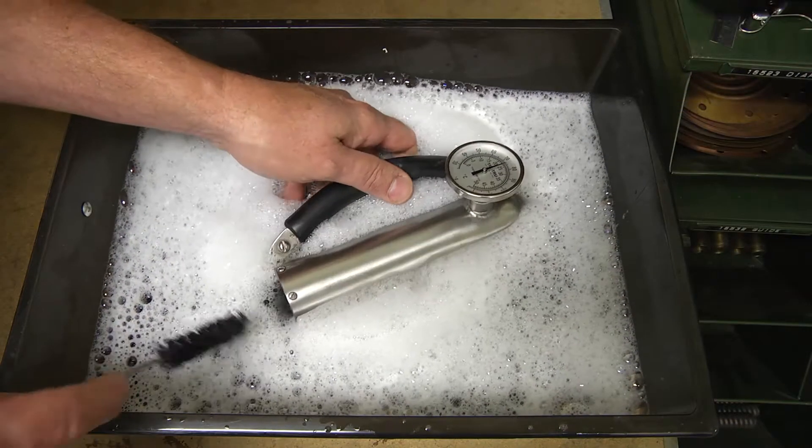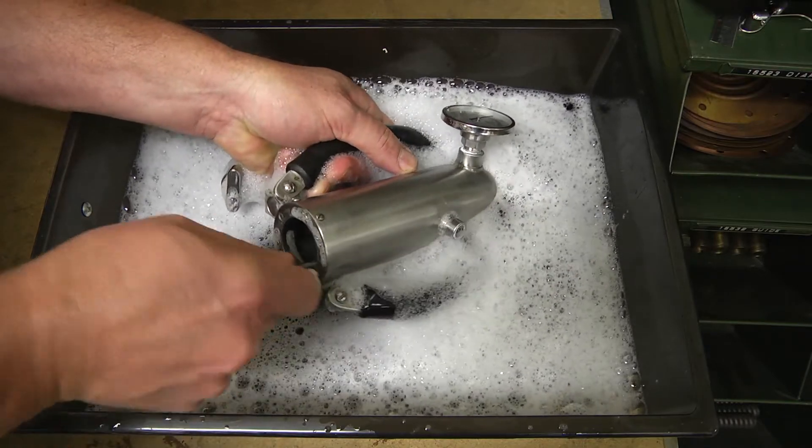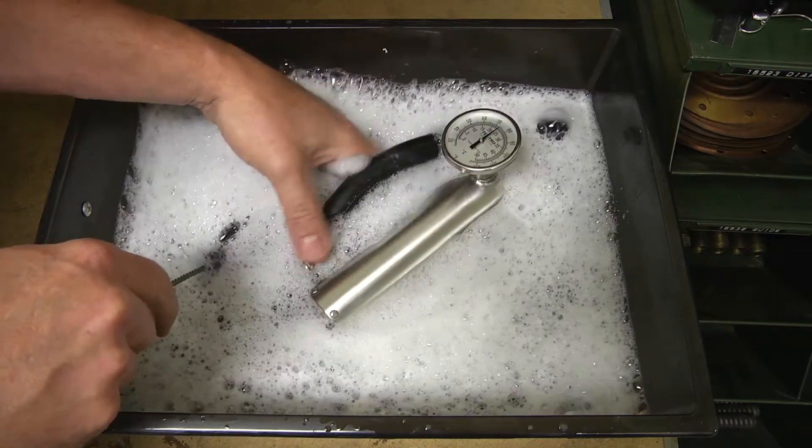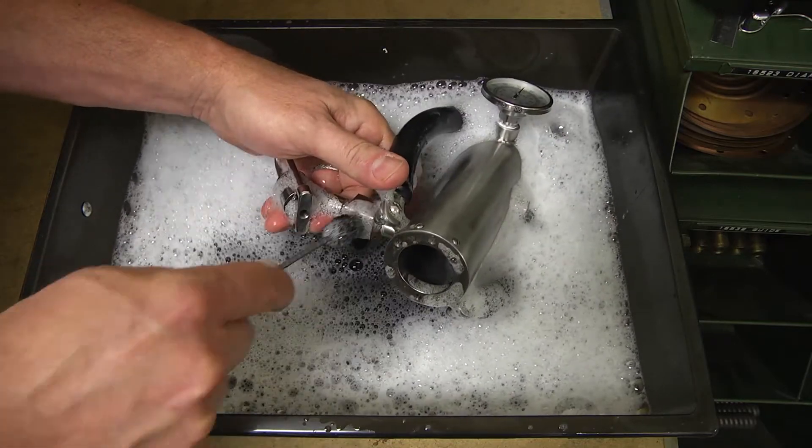Wash all parts of the volume meter in warm soapy water. Use a bottle or test tube brush and scrub the bore of all the valves, the sight glass assembly, the inside of the unit, and threaded bosses.